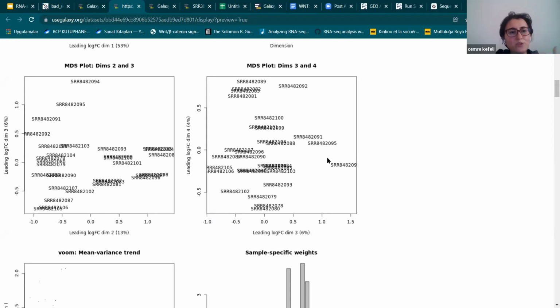Yeah, I'm showing what I did previously. Okay, so there was more. Yeah, this one has like 30 samples. I'm showing you what I did before, because we have to wait for this analysis. Differential expression actually doesn't take much time, but the other steps take some time.